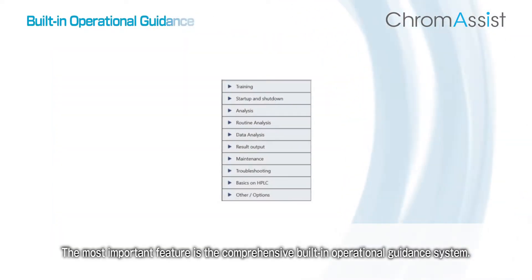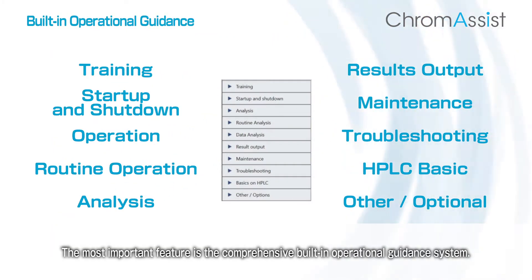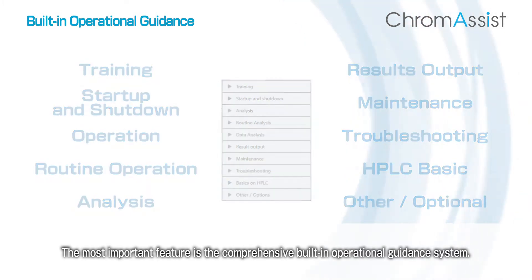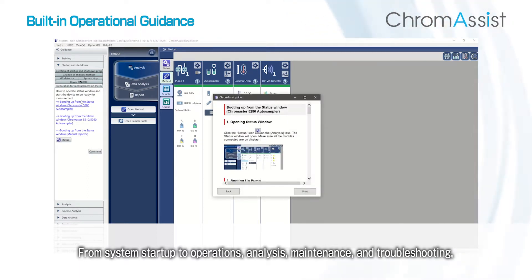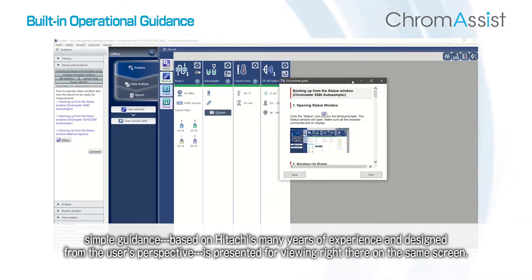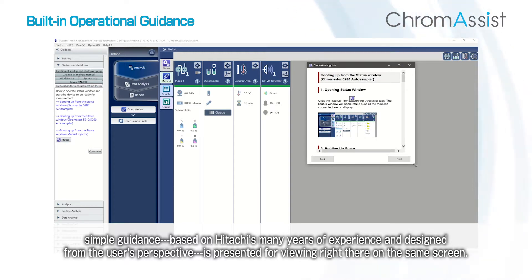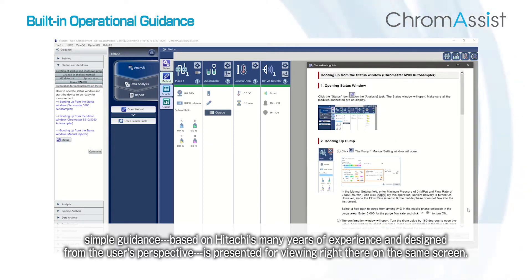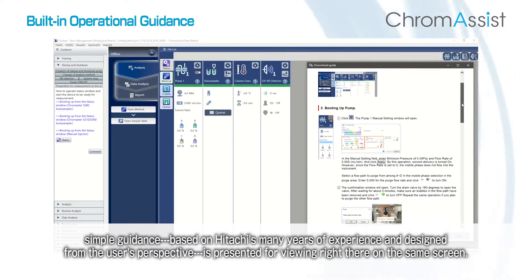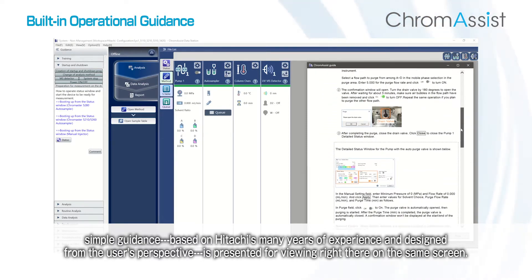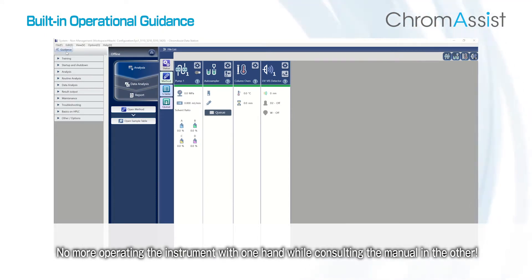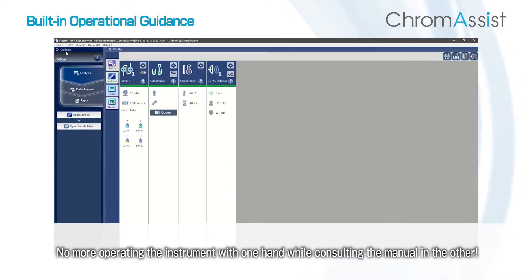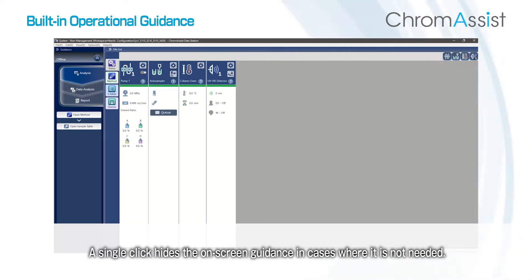The most important feature is the comprehensive built-in operational guidance system. From system startup to operations, analysis, maintenance, and troubleshooting, simple guidance based on Hitachi's many years of experience and design from the user's perspective is presented right there on the same screen. No more operating the instrument with one hand while consulting the manual in the other. A single click hides the on-screen guidance in cases where it is not needed.